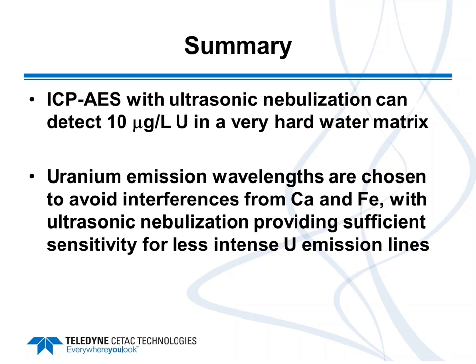Okay. Are there any plans to try heavy metals analysis of flowback water from oil fields using the U5000? Yeah. That certainly would be a thing to look at, especially fracking water. That would certainly be a potential future application. That type of application has been run with our AES Express Plus system for a rapid sample, but if there is a need for detecting lower levels, certainly that's something that can be looked at with the USN.